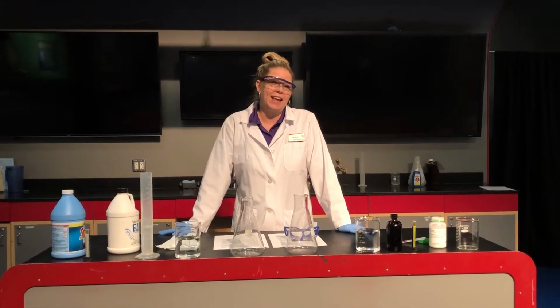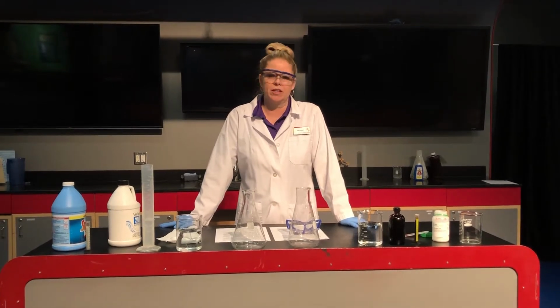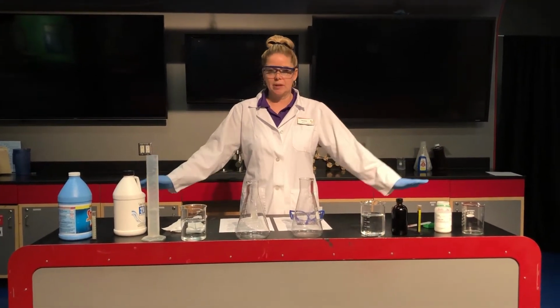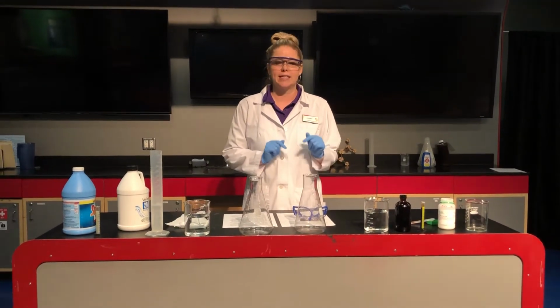Hi everyone, this is Valerie from Arizona Science Center here to do a chemical reaction with you today. The chemical reaction that we're going to do is called iodine clock. So I have a bunch of ingredients up here today, and before we get to it, we do want to talk a little bit about safety in chemistry.